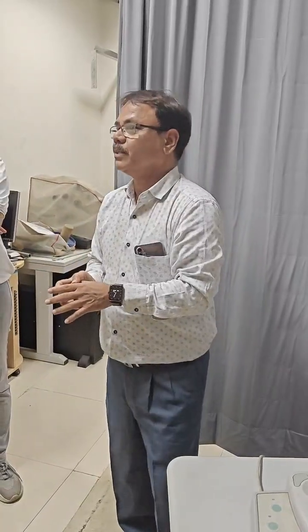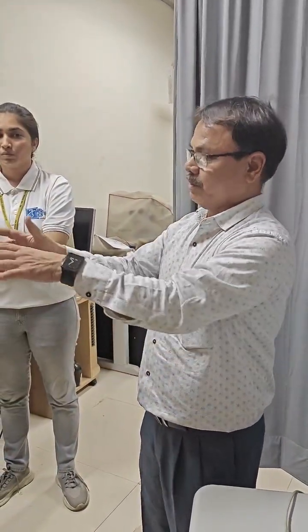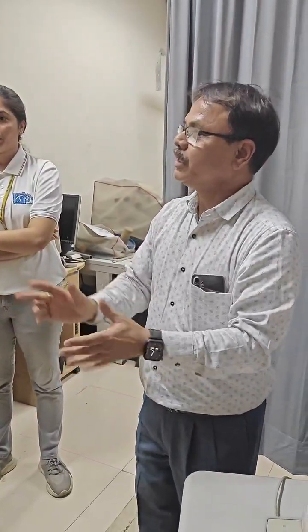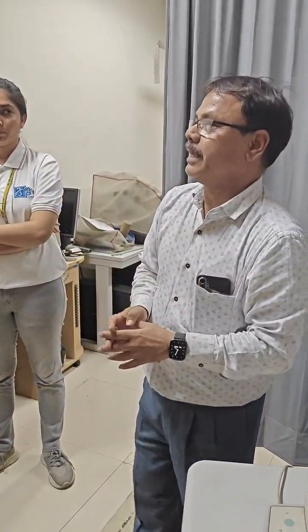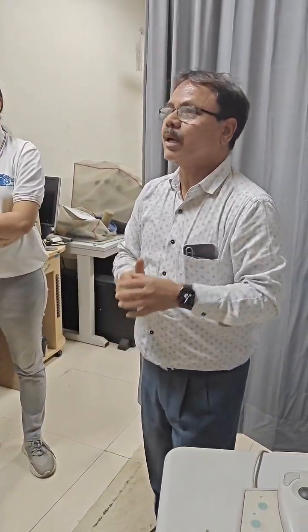And for biology, somebody was asking. Yeah, so there is a cryo microscope, cryo-TEM. It helps the structures to be preserved in their original state. See, your biological sample cannot be dry. If you dry it, it loses its morphology. Correct. So for that, cryo-TEM is there. That is a different technique used for the biological sample. Okay, so sample preparation is the most critical part of this machine basically.